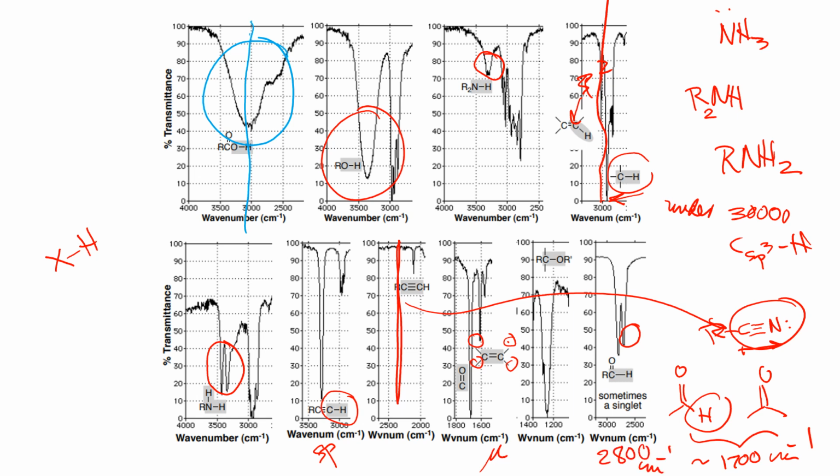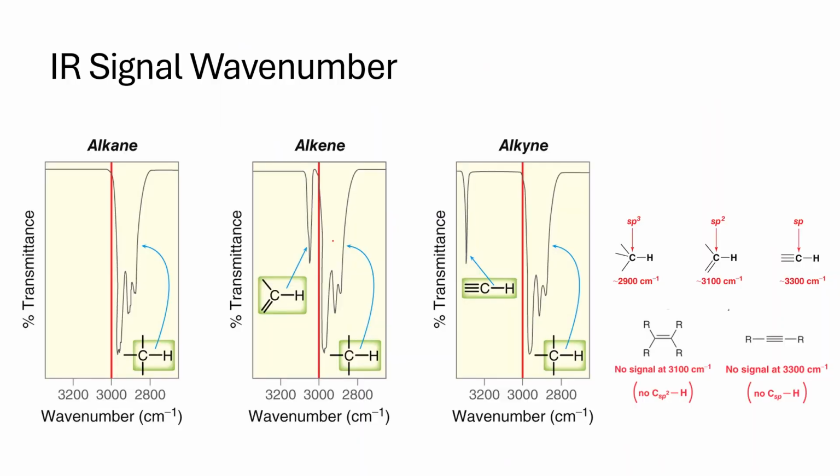That is what lets you differentiate between aldehydes and ketones. Okay, these are shapes that we want to remember. The chart you're going to have. These are the lines that I told you. So draw your line at 3000 and see here right under.